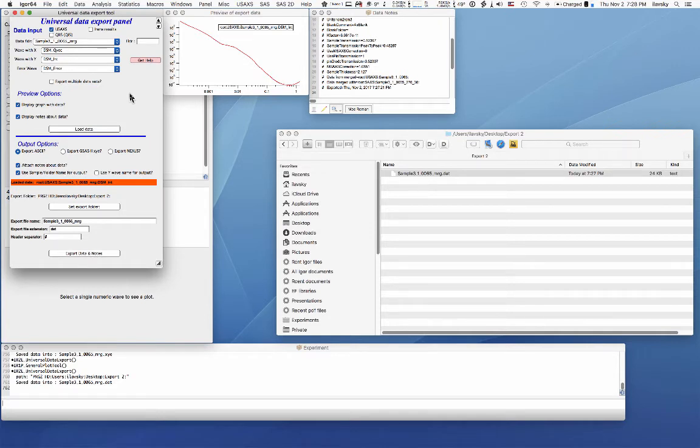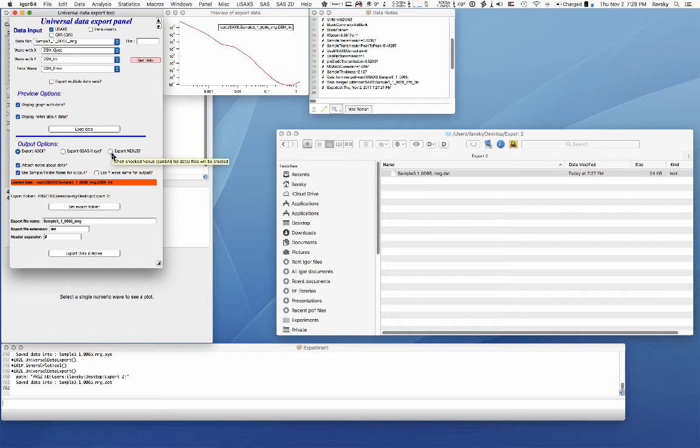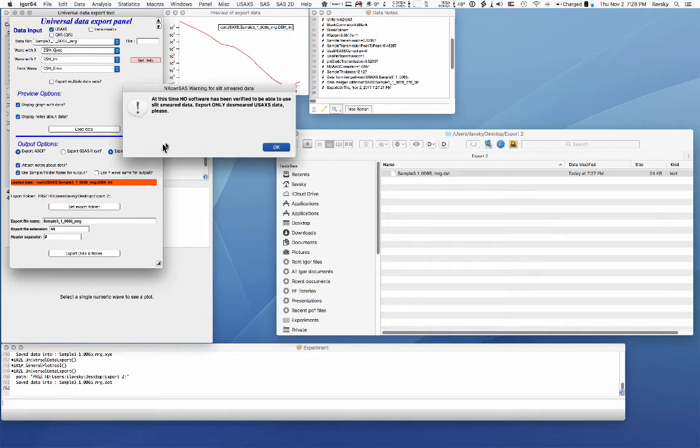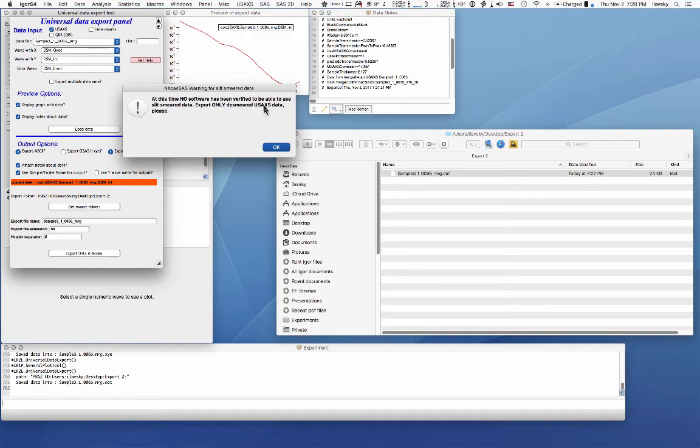If you have a newer package, I believe SASView or SASFit, one of those two can do it. There is a new definition of CanSAS Nexus. So this one is, if you check that, it will export an HDF5 file, which will have data written based on a standard, which is HDF5.